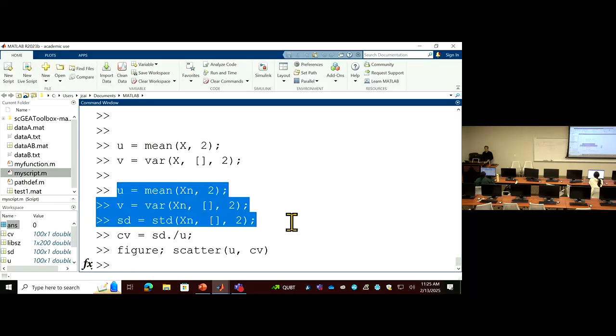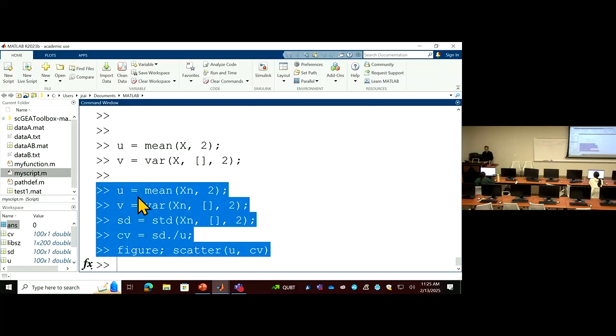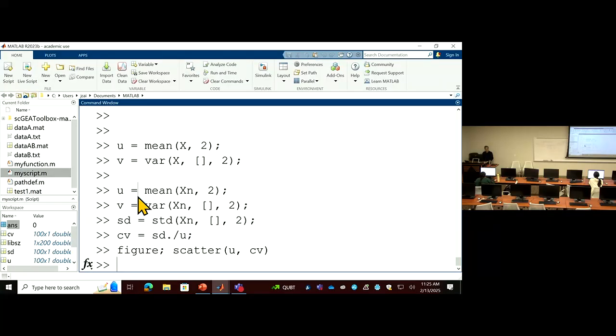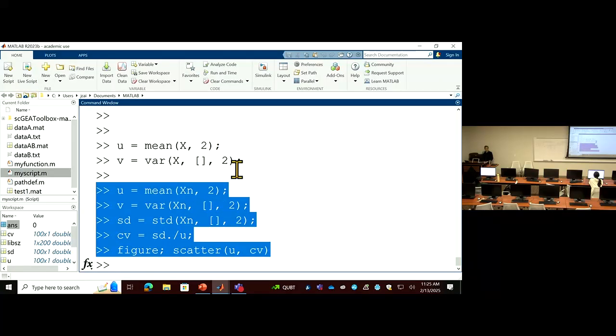Remember, our data is simulated, following some distribution. There's some noise because of the random number generator, but not much. Most of it follows the distribution we just described. But let's see a real data set.